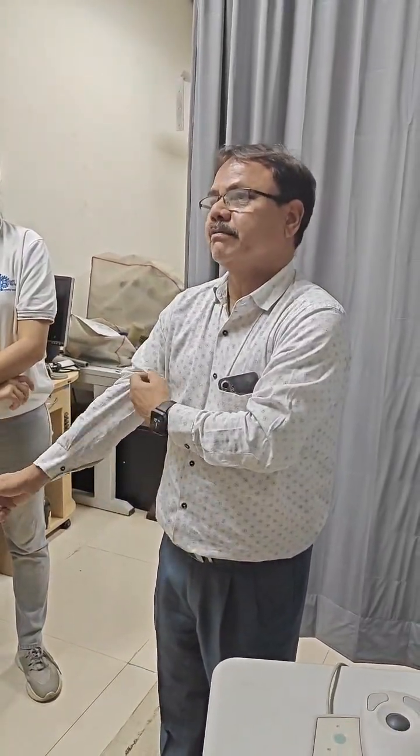I am not talking about 3 kilovolt. See, electricity in our house is 230 volt only. But 300 kilovolt, that is 300,000 volts. So that generates a very intense electron beam, so that it can pass through your sample. And then you can magnify it, so your energy is spread, and you can get good pictures with that. The only tedious thing is your sample should be transparent here compared to SEM. So you have to do so many things.